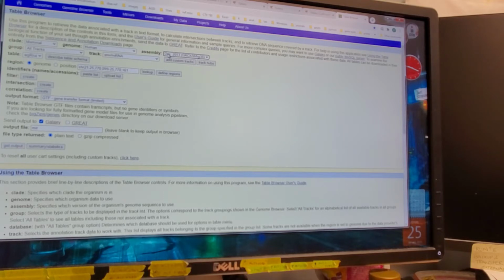So if you all of a sudden see February 2020, a new genome build, you don't necessarily want to use that. Sometimes newer builds are not as effective as older ones, or they might be better genome builds, but they have an error in the specific spot where you're looking. So that's all stuff that you just have to know.